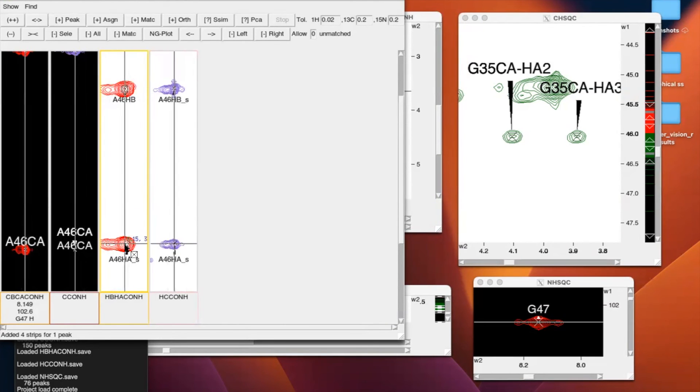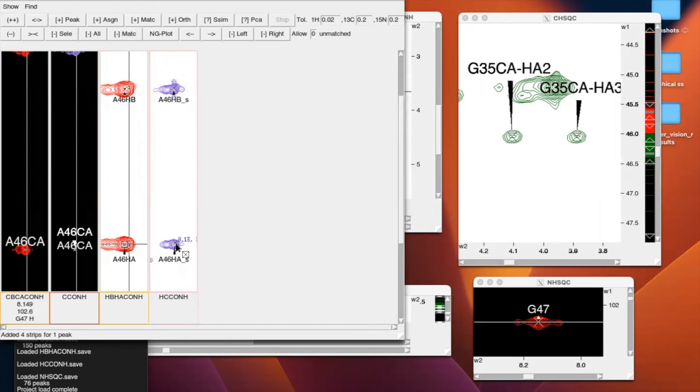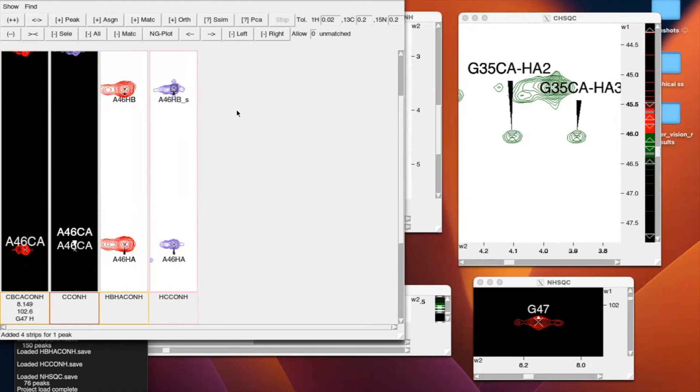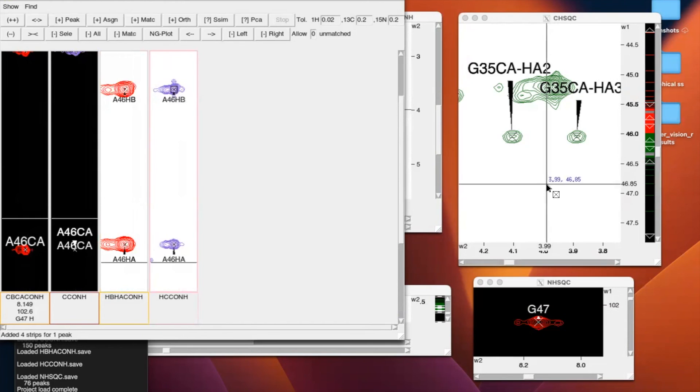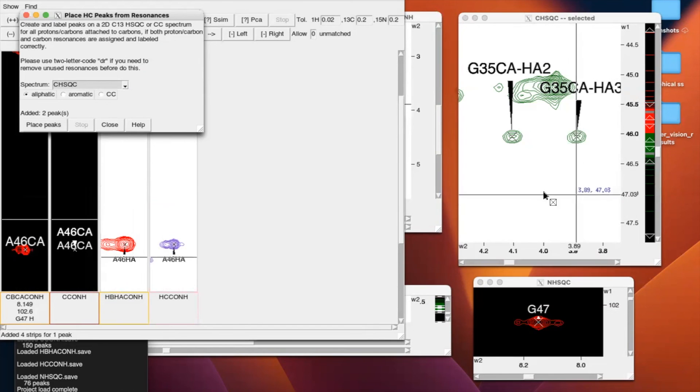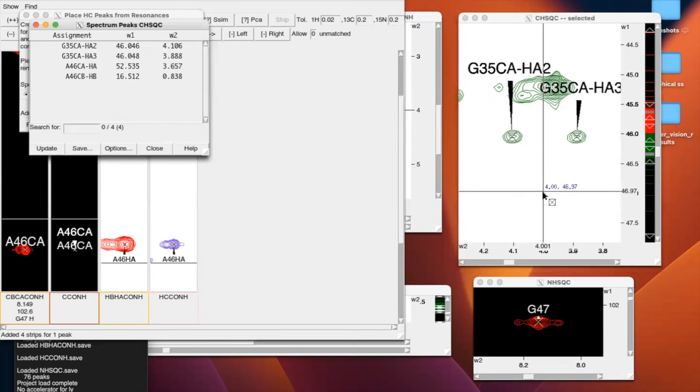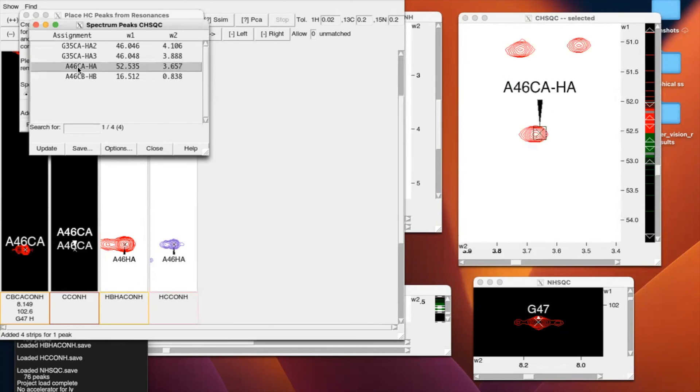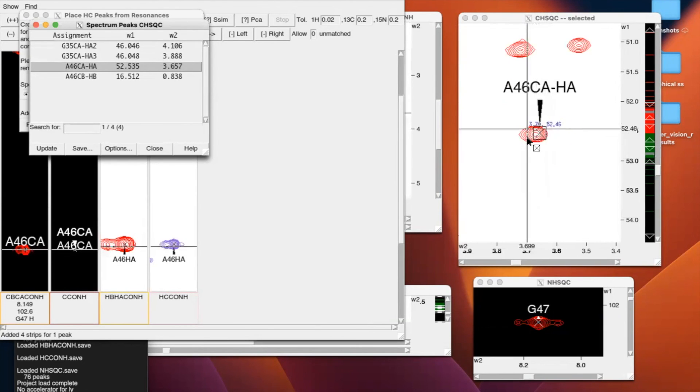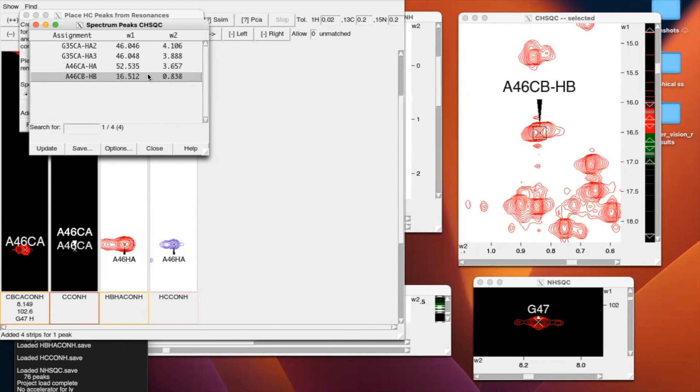Then with CHS-QC, we're going to enter the two-letter code HC. CHS-QC, aliphatic, place peaks. Then we can go back to CHS-QC, two-letter code LD, and see that they've been added. So I can click. I can see that it's not centered. So PC, two-letter code.